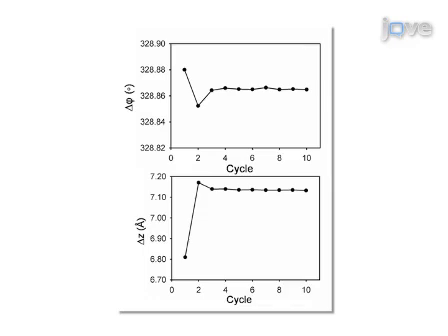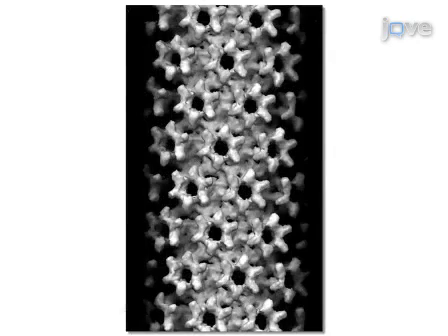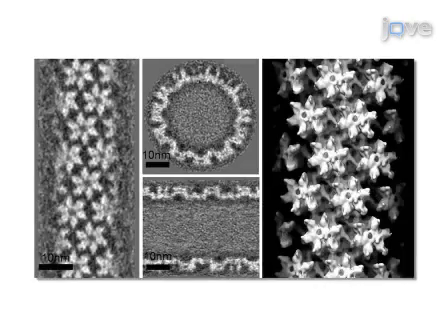5,195.48 angstroms, the screw symmetry of the tube was determined as delta Z equals 6.81 angstroms and delta phi equals 328.88 degrees. Delta Z and delta phi were refined to 7.13 angstroms and 328.86 degrees using IHRSR, and an initial reconstruction was generated after 10 iterative cycles. The final reconstruction, after iterative refinement, improved the density map significantly from the initial model calculated with IHRSR.